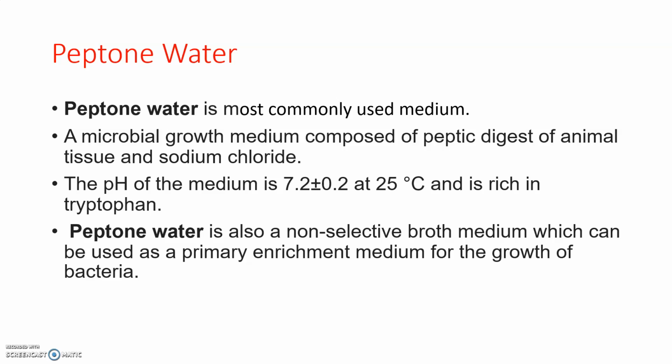This peptone water is also rich in the amino acid tryptophan and is used as a non-selective broth medium which can act as a primary enrichment medium for the growth of bacteria. So it is a non-selective broth medium.